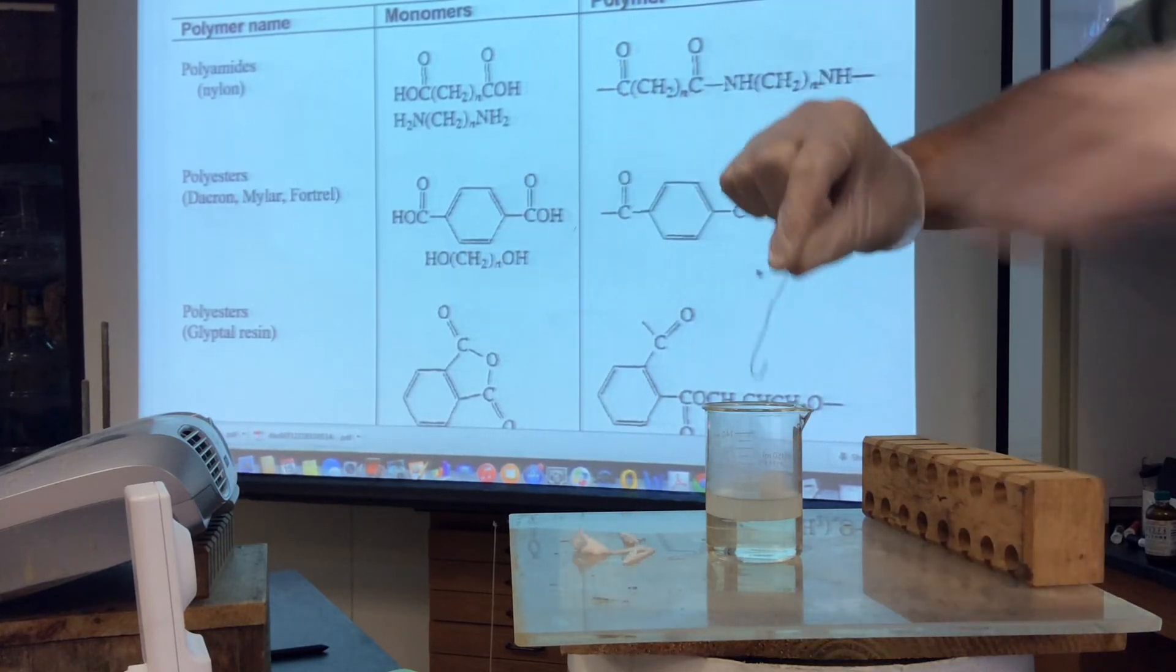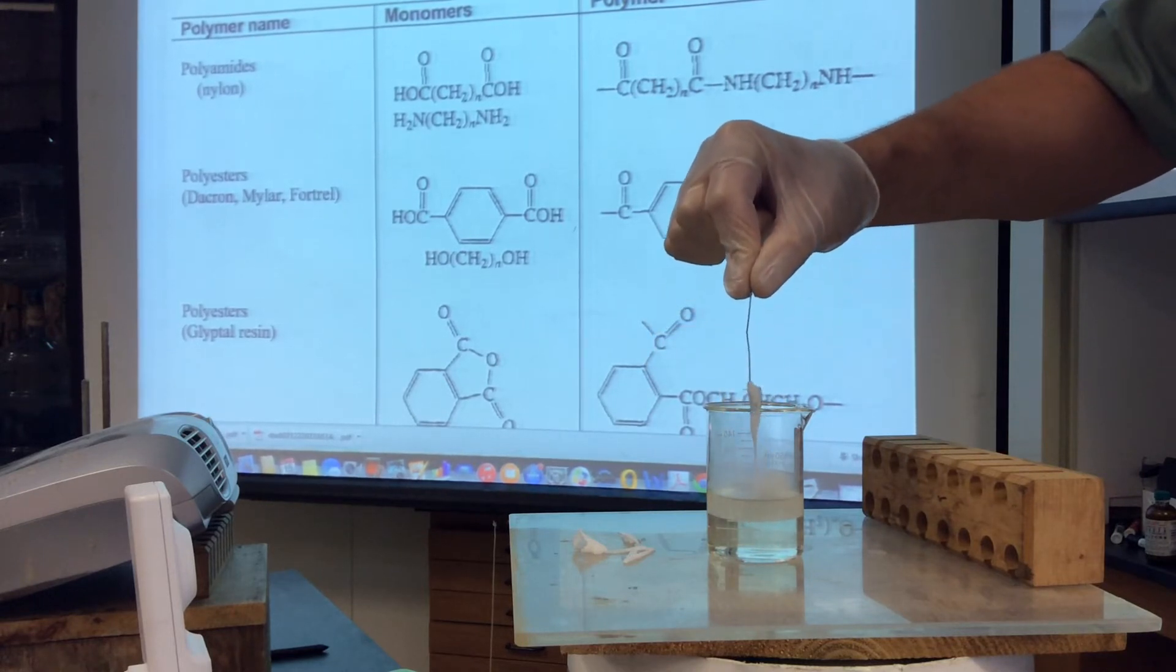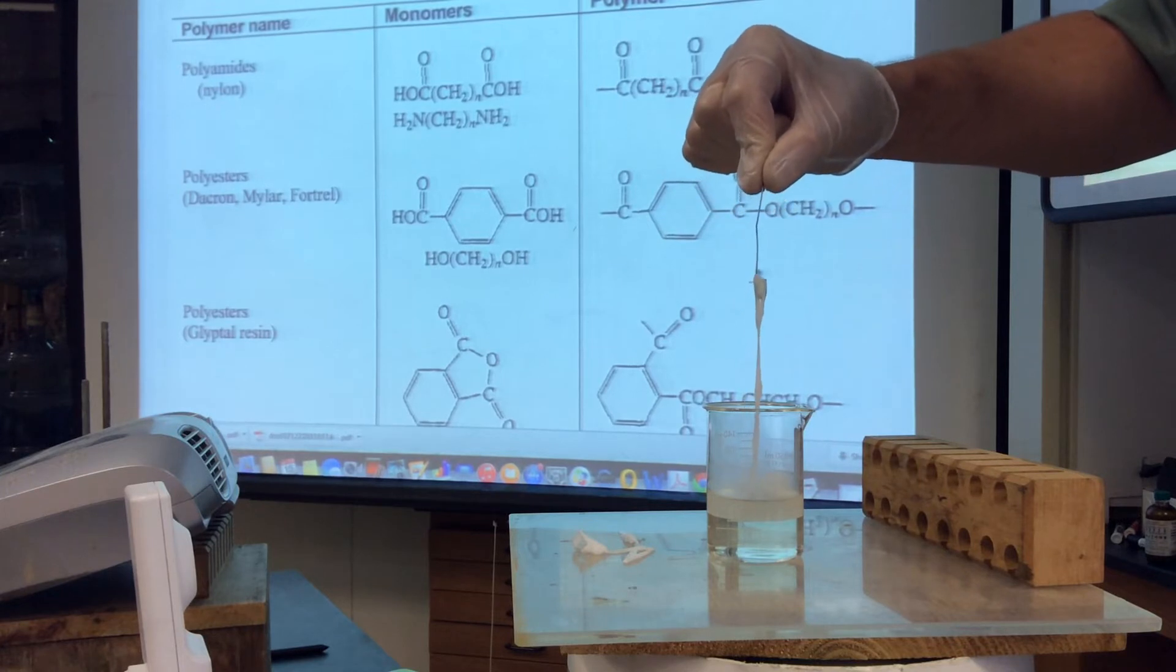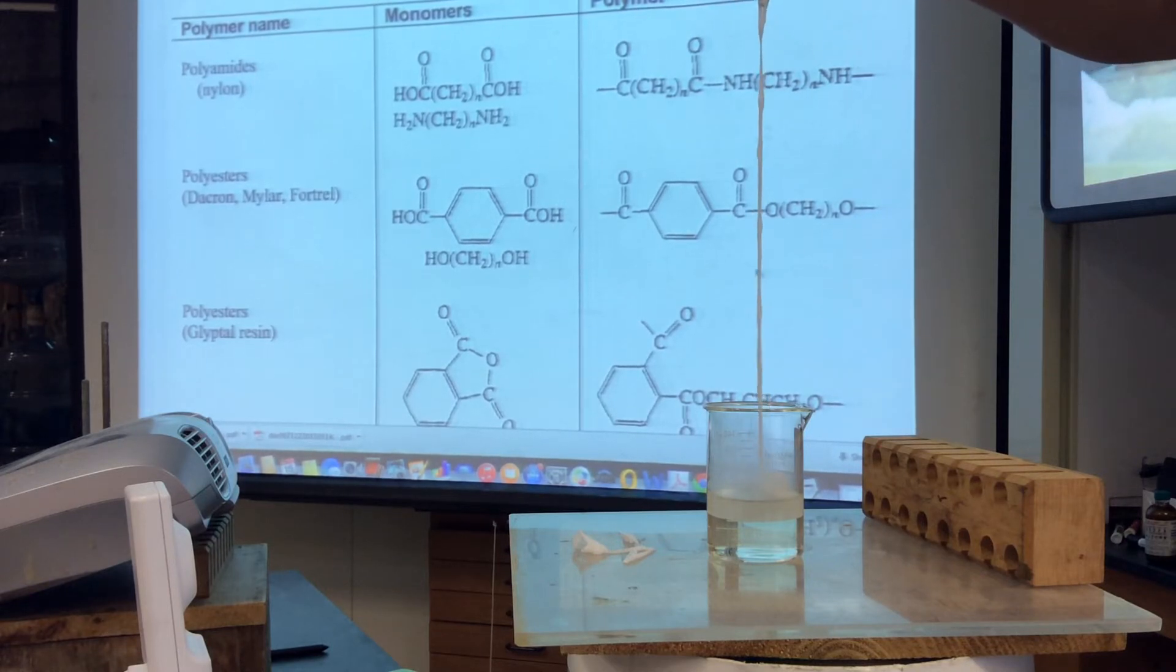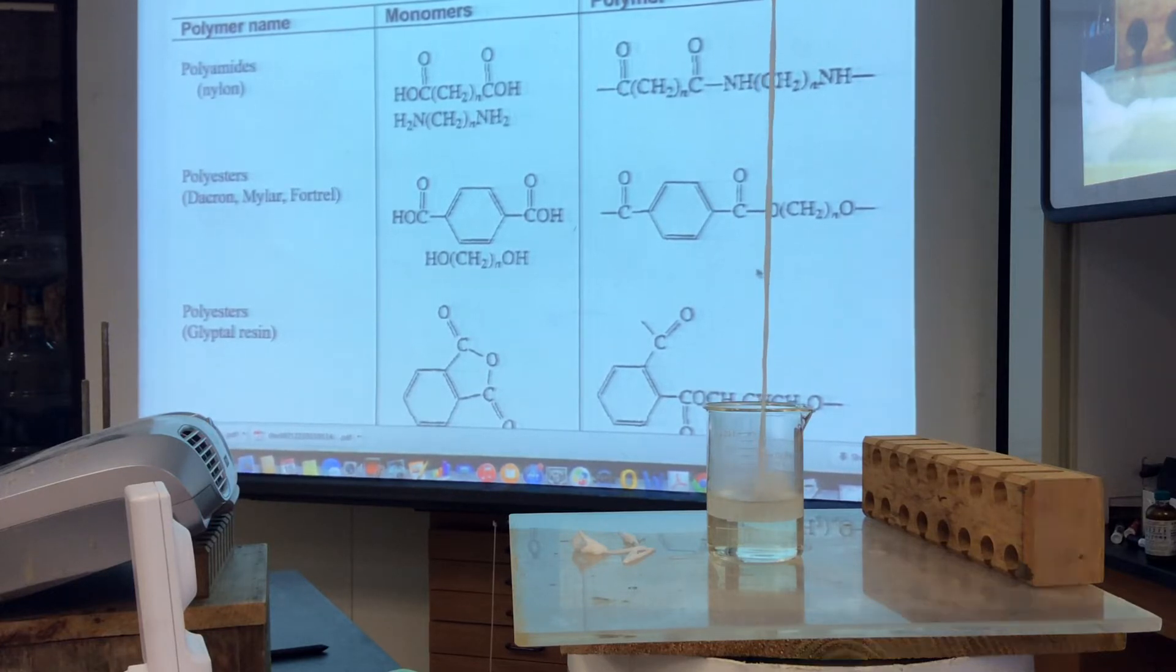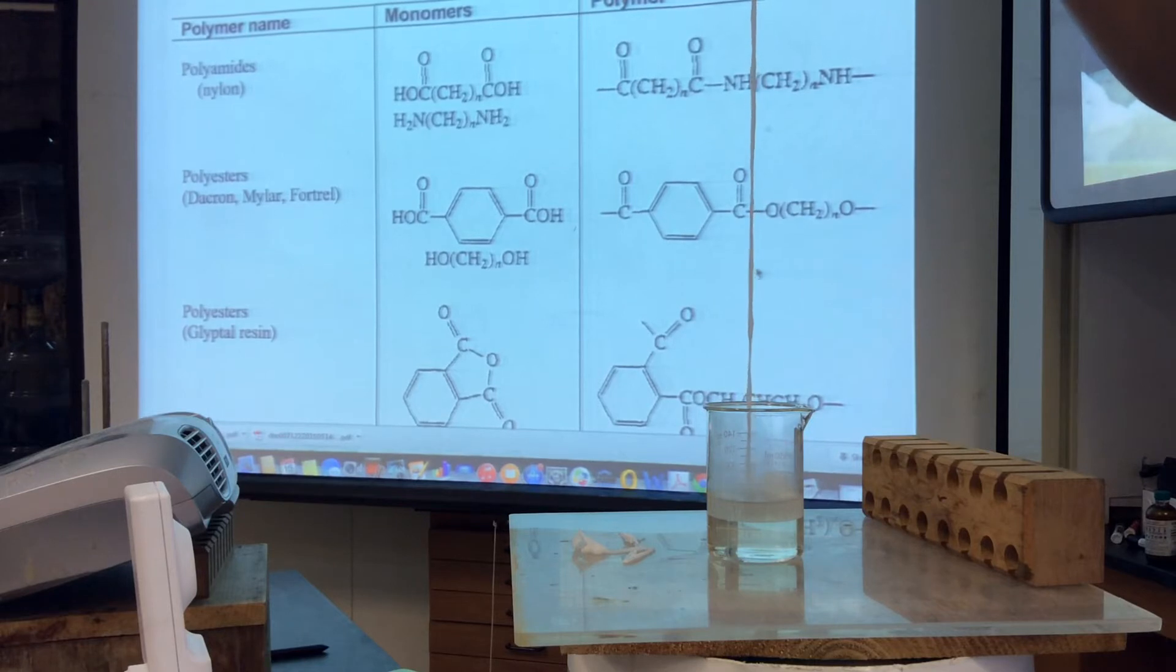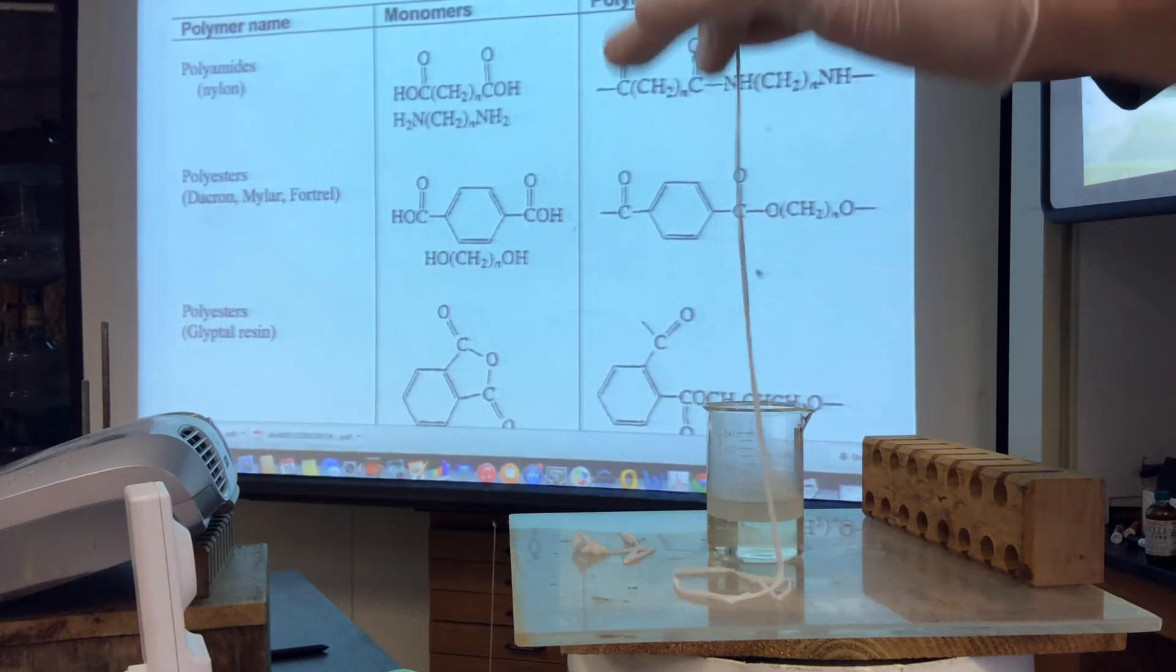I'm going to try that again. Water is coming out. And the vapor is just the adipoyl? Yeah, it's just a vapor. Are you piercing through the... Yeah, I'm pulling one layer through another. And what's happening is I'm causing the what? Condensation polymerization. These things are now... The monomers are what? Monomers are lining up. And I'm making nylon. That one's a lot longer. Alright. So you can see, definitely, monomers were made here to make something as long as this. We'll do one more.